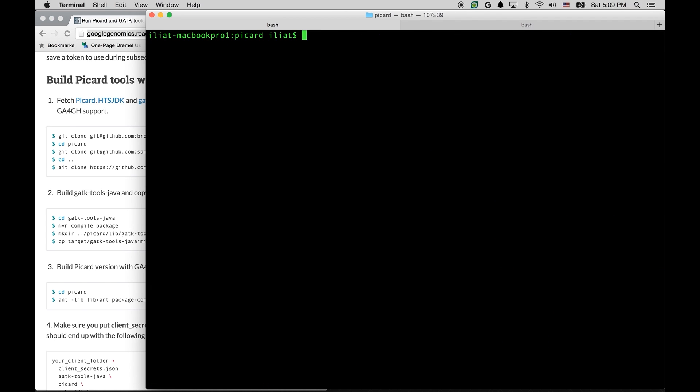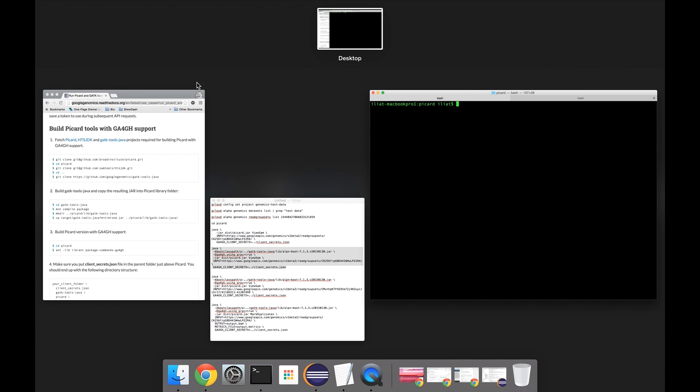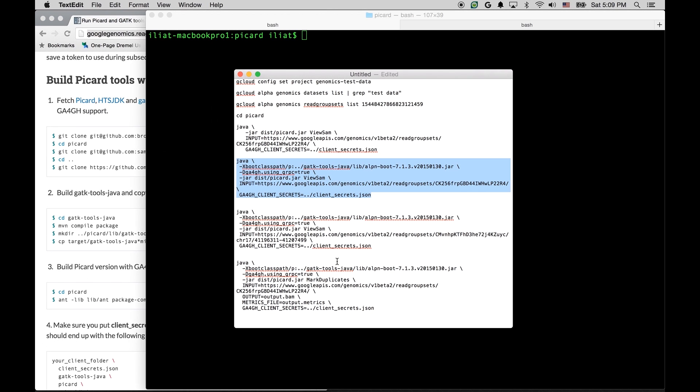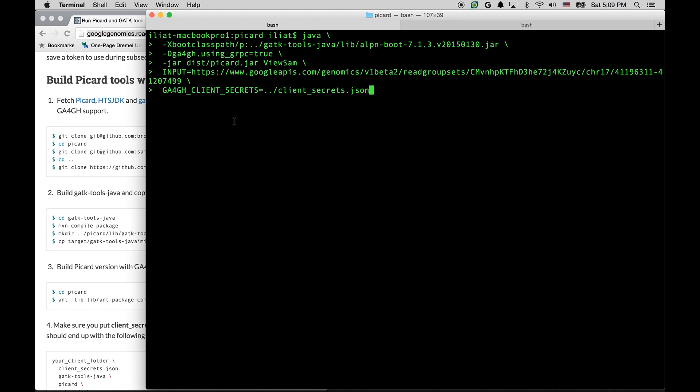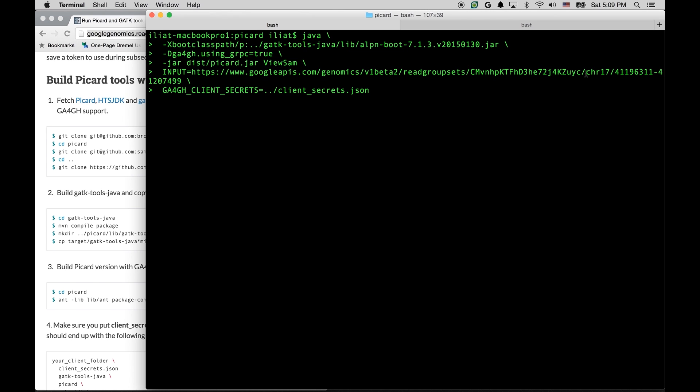Now, let's do something else. Instead of specifying the full read group set to process, let's specify a genomic range, because we could have a big dataset, and we only want to process part of it. Here is how the command line will look for that. So you will notice it's pretty much the same, and the input URL is very similar.